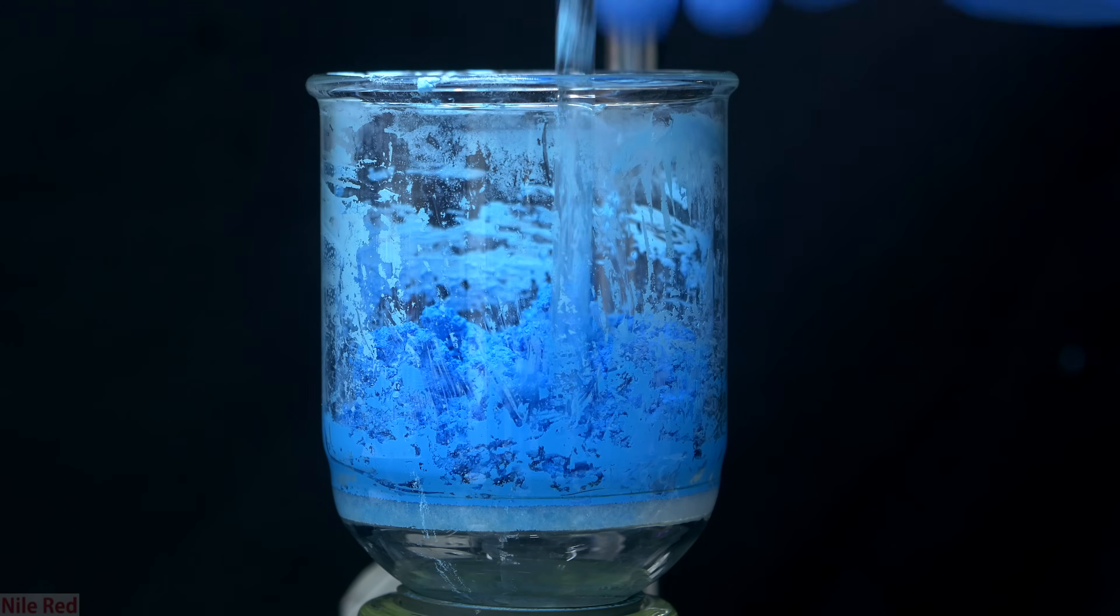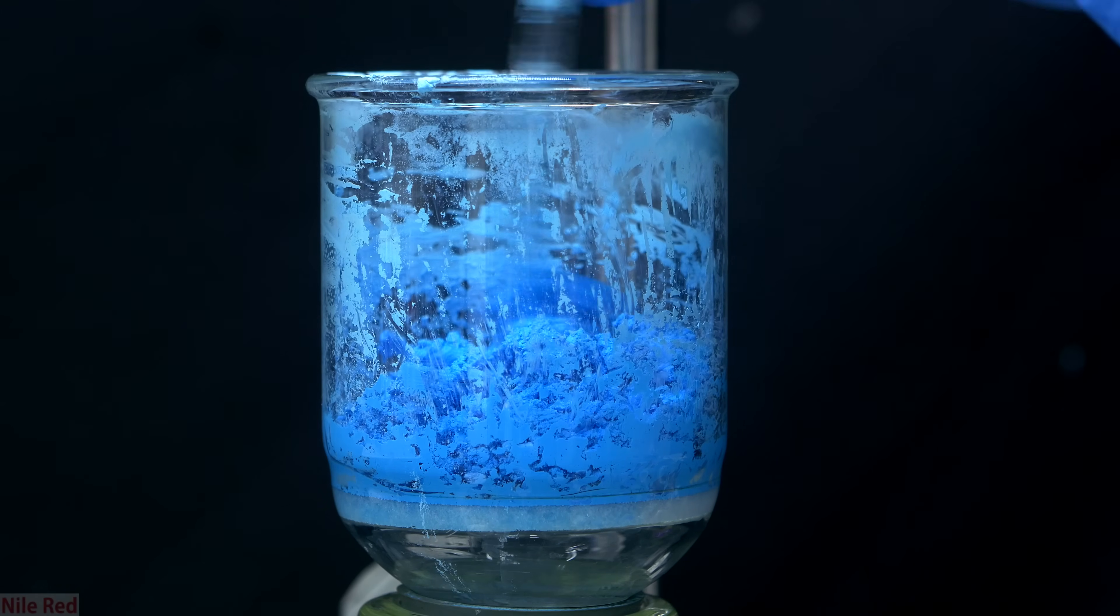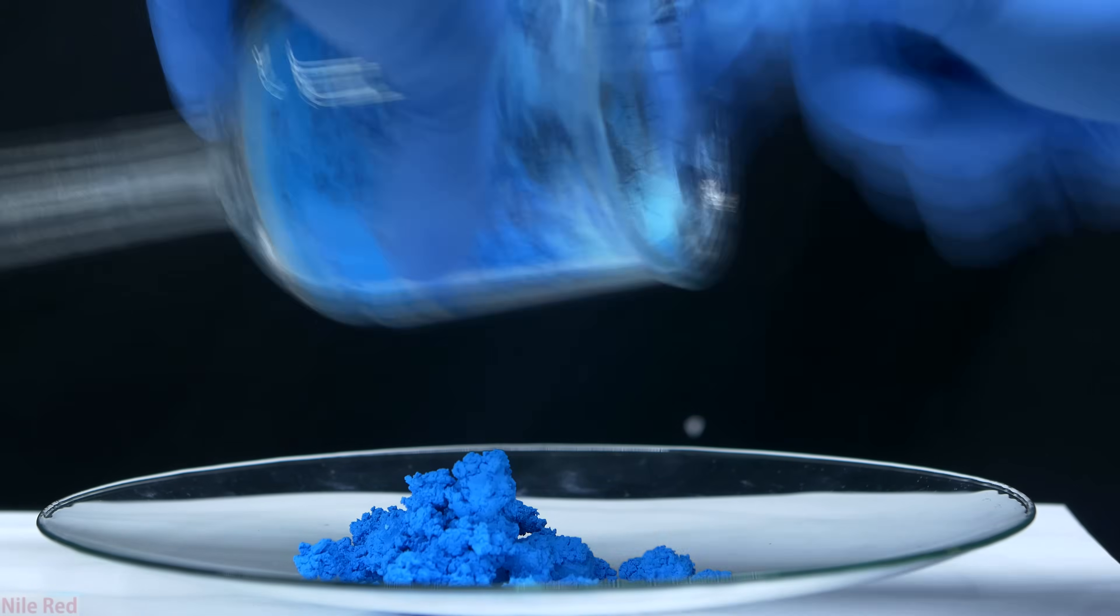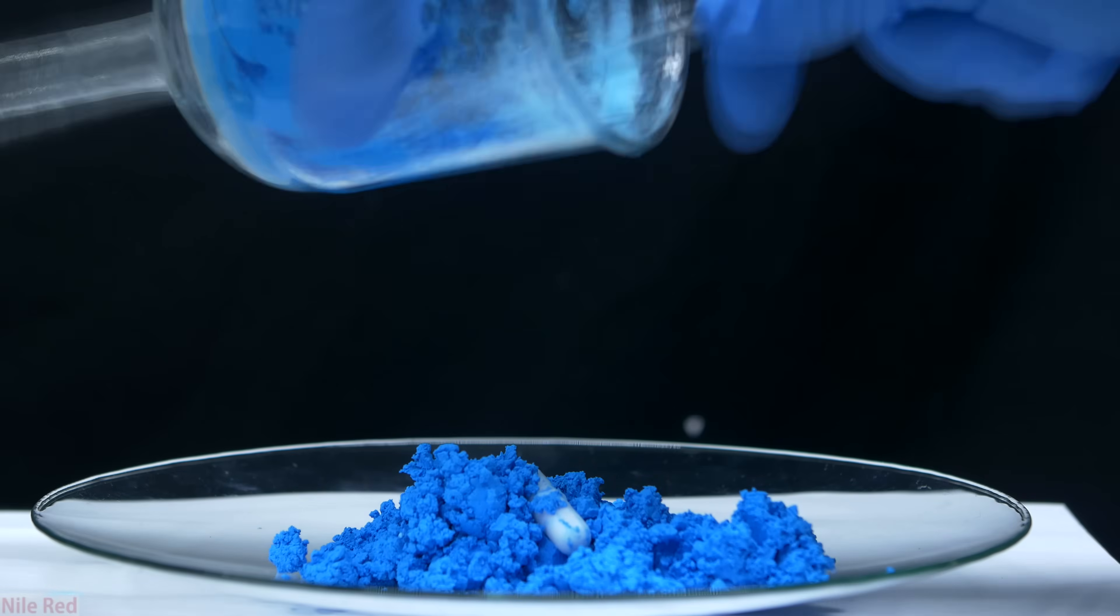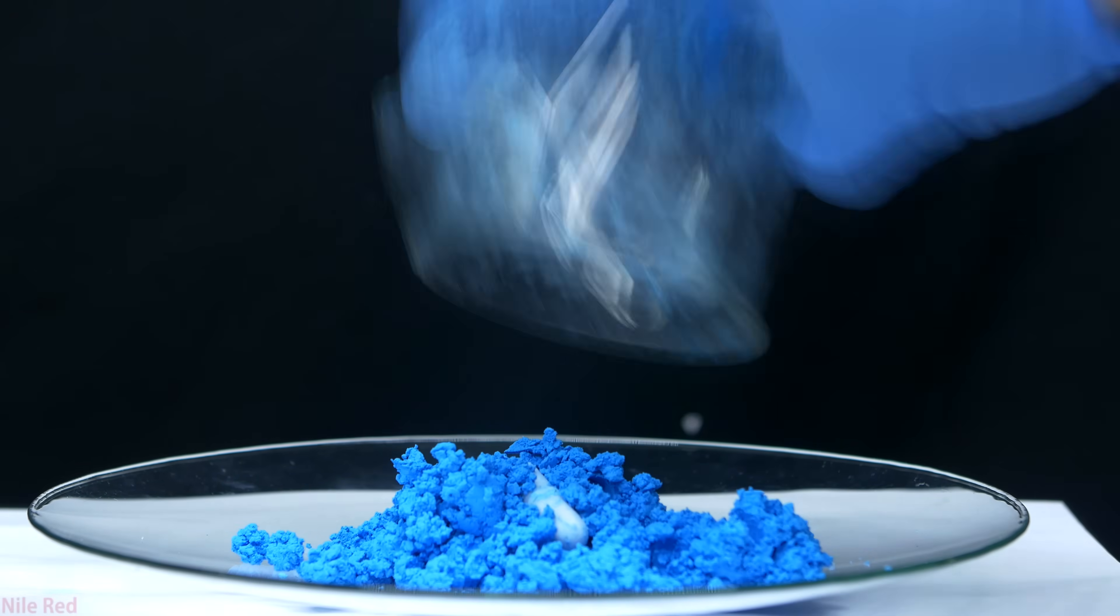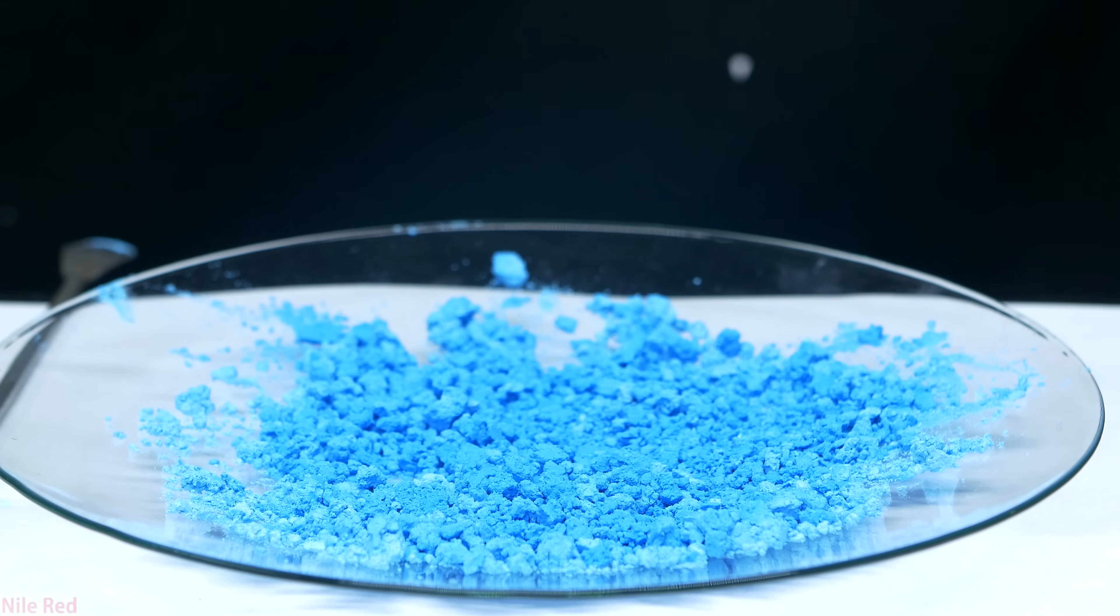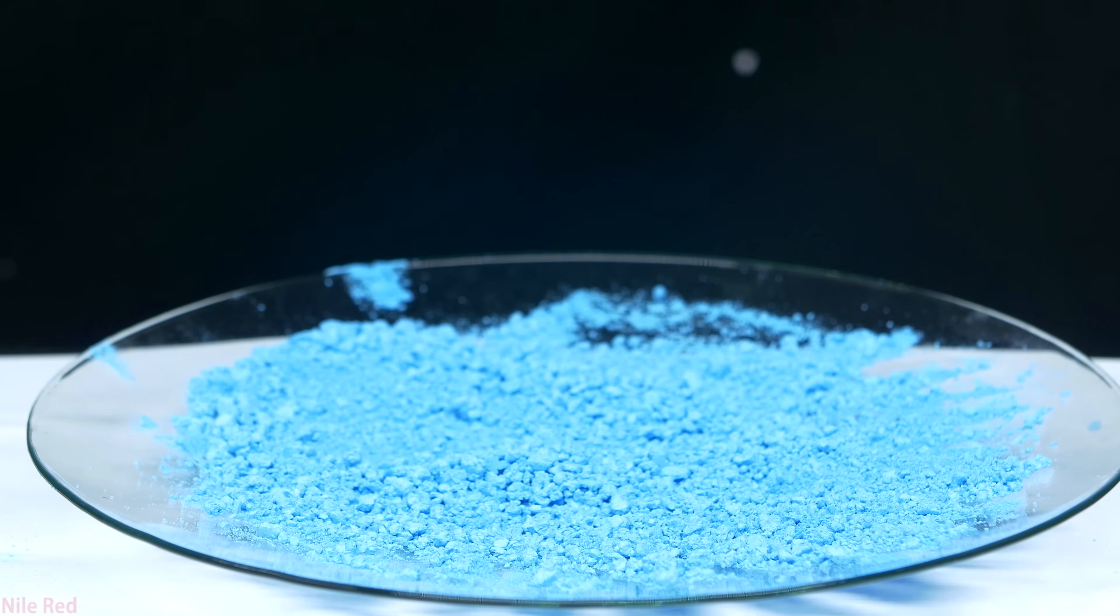After all of the acetone had been removed, we're left with a semi-dry paste. The rest of the acetone will be removed by evaporation, and to do this I transfer all of the copper hydroxide to a large dish. I left it out to dry, and every so often I came around with a metal spatula and broke up the larger chunks.